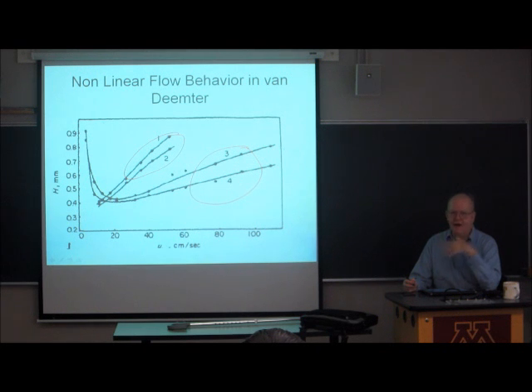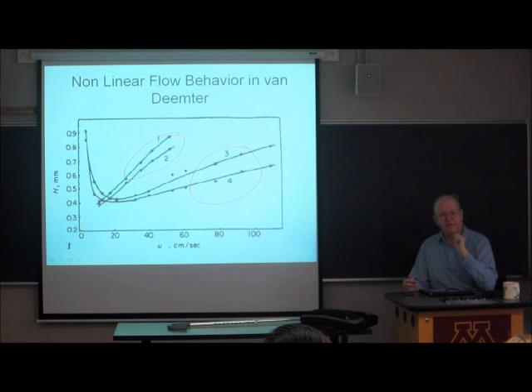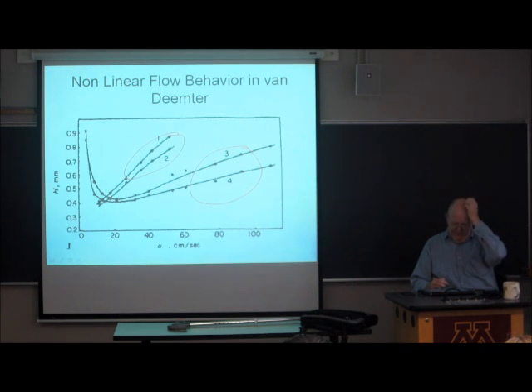Here, I always like seeing a straight line because I say, oh, it worked again. It's nice to see one every now and then. There's an awful lot of reasons why we have deviations from exact fitting of the Van Deemter equation. This happens to be for gas chromatography, but we see deviations also in liquid chromatography.